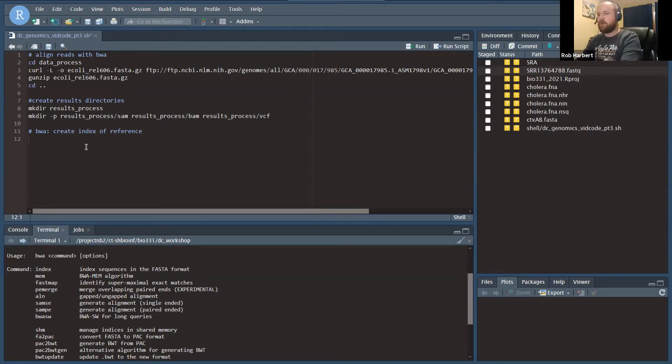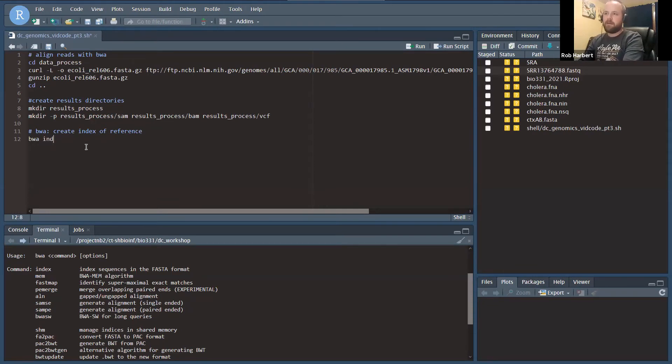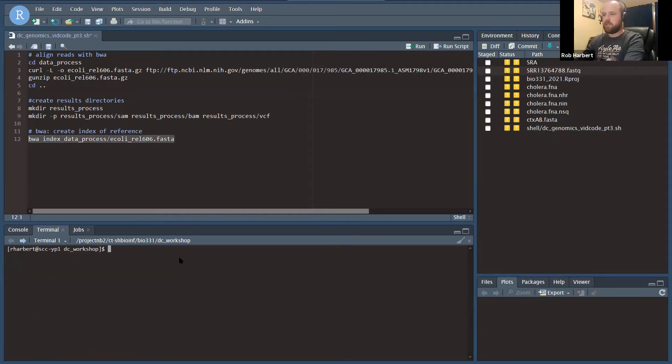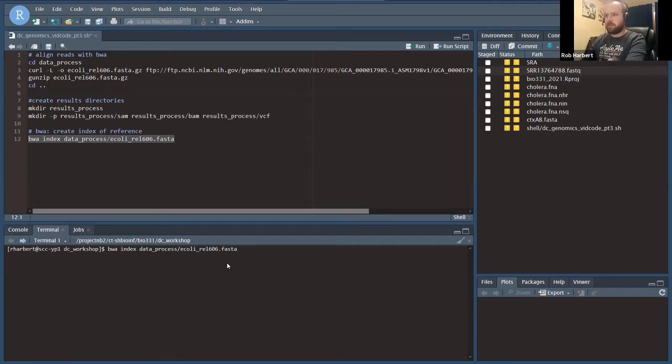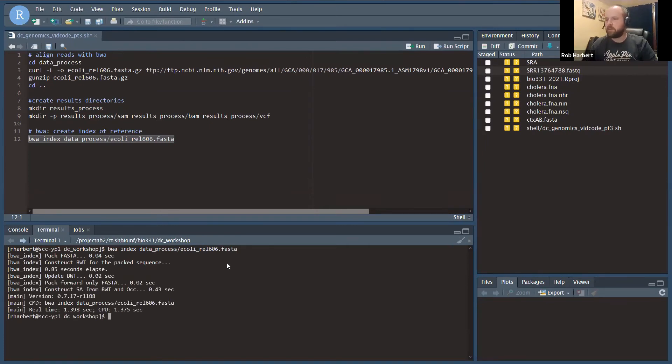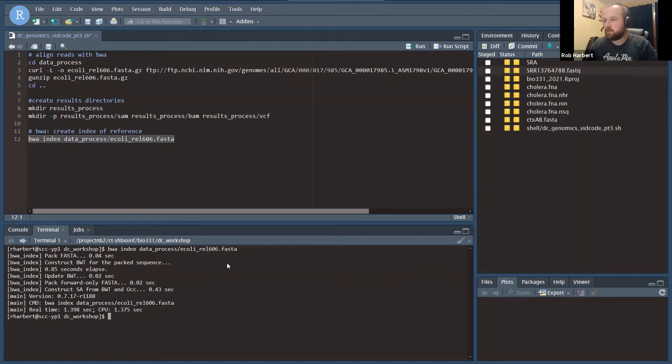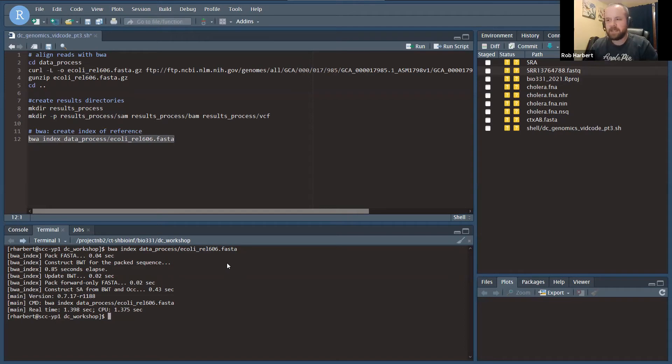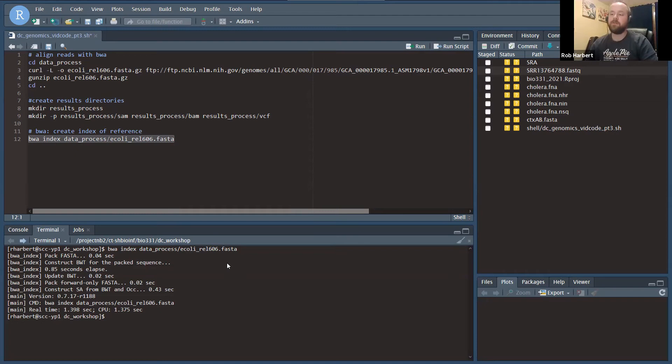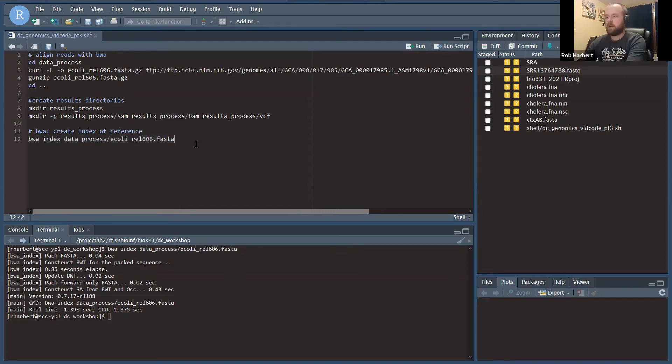We're going to point BWA index at our reference genome, and that's it. Let's go ahead and get that running. It doesn't take long for this one. This is a process that does not scale linearly. The larger your genome is, the more complex this index becomes, and the more difficult it is to compute. For the E. coli genome, about 4.6 million bases, under two seconds to index that genome. But that can be time and space consuming if you're doing something like indexing a very large genome or a whole bunch of genomes.